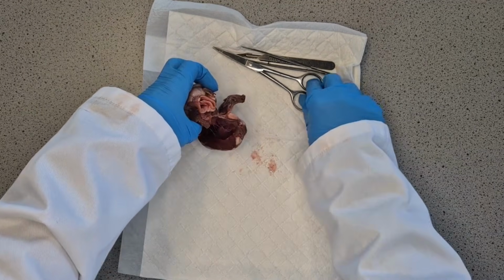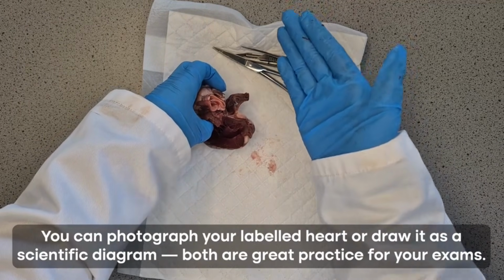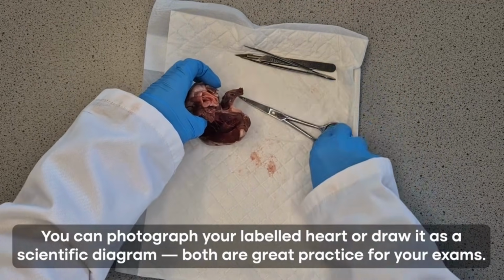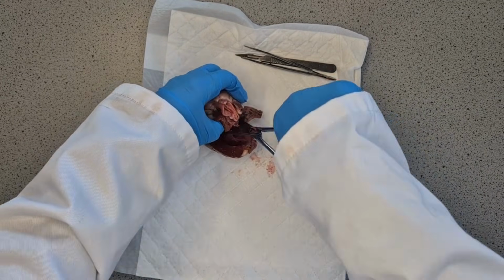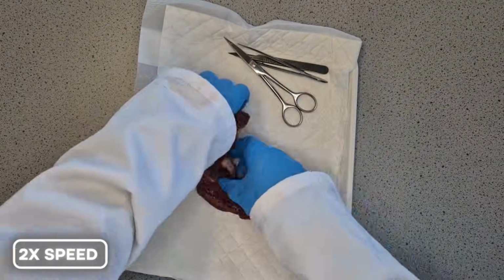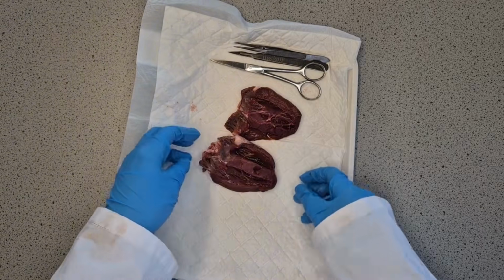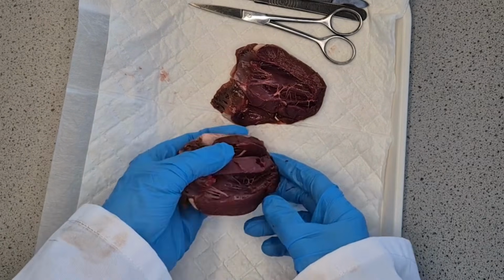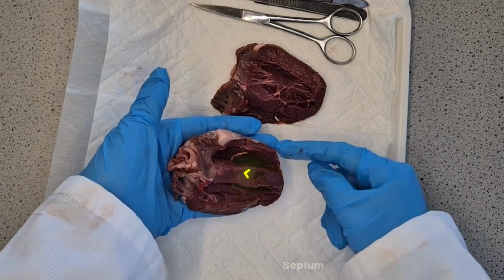I'm actually going to cut down the septum now, so we can then see at the same time the right side and the left side to see the difference in the thickness. I would get them to take any photos though before they do this, because you can't undo it. So there we go. I've now cut the heart in half, and we can see this section here. That is the septum separating the left side of the heart and the right side of the heart.